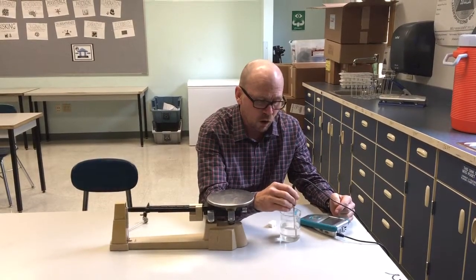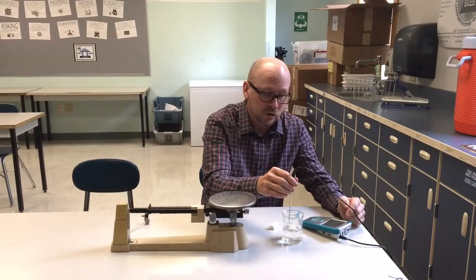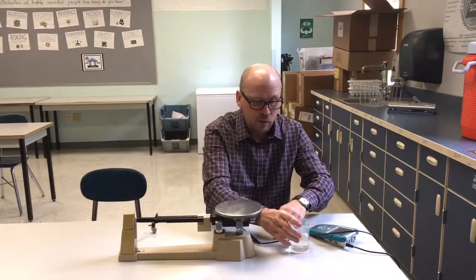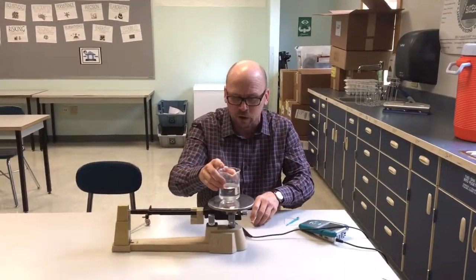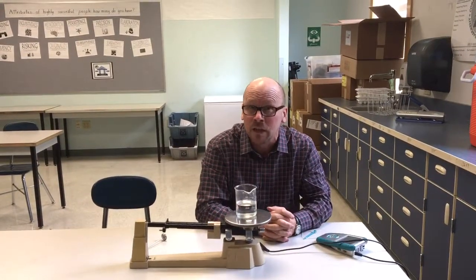When the sugar is all dissolved, you can take your thermometer out and stop your LabQuest once the thermometer is out. Then you're going to take your water, at this point with dissolved sugar, put it back on here and find out if there's been any kind of change in mass.